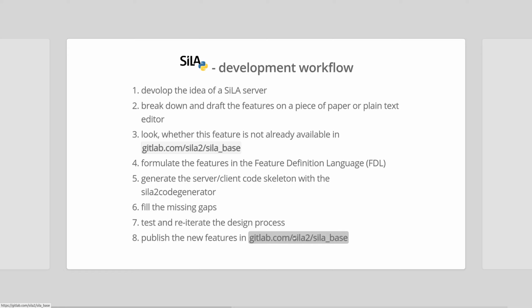That makes it much easier to reuse these features, use them in a different context, and build something nice with it.